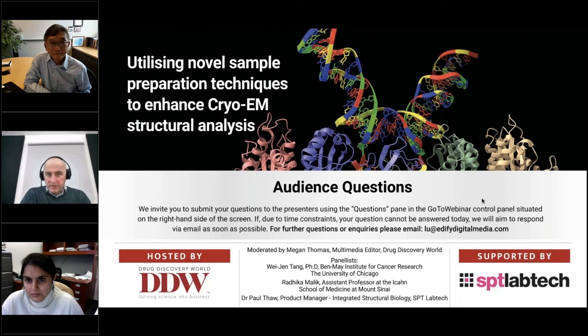And perhaps related to that, an earlier question which pinged through that I just saw there. Actually, I might be able to answer this one myself. One of the earlier questions which came in during the actual talks was, when freezing with chameleon, I would imagine you need higher protein concentrations. Is this the case? I guess you can both answer this in a completely open way, and I'll give my view on it as well.